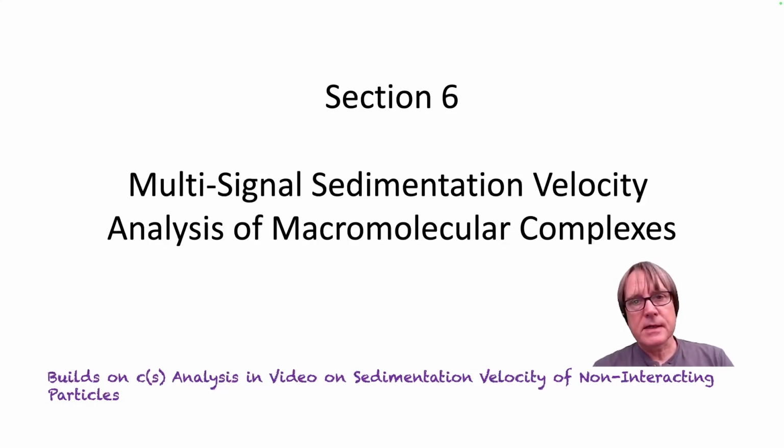And that's certainly the case for slowly interacting systems, but even reaction boundaries of fast systems can in many cases provide good approximations of the complex stoichiometries. So let's see how these multi-component sedimentation coefficient distributions work.